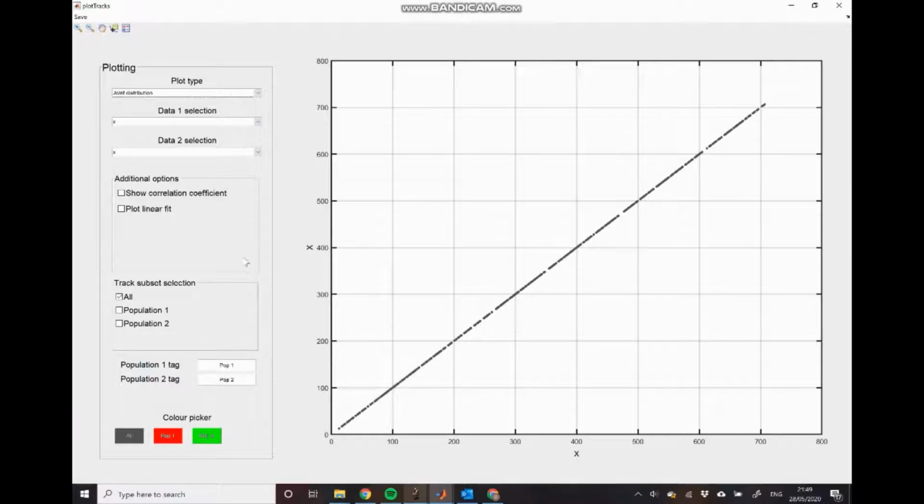Before this video, I split all of my tracks into two separate populations, similar to what we discussed in the previous video about splitting different events. Now we're labeling tracks according to the population they belong to. In this case, I've split the tracks according to species, so approximately half of the tracks correspond to Pseudomonas aeruginosa, and half correspond to Vibrio cholerae.